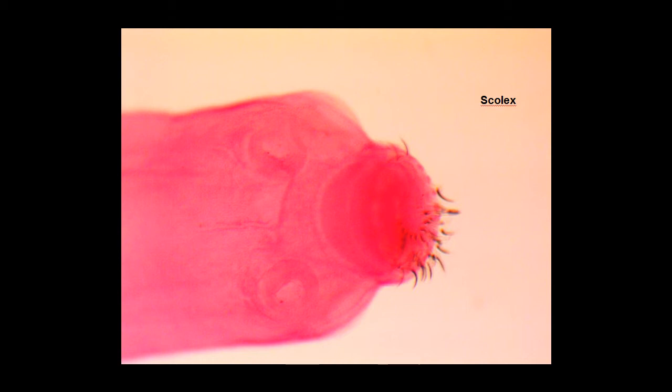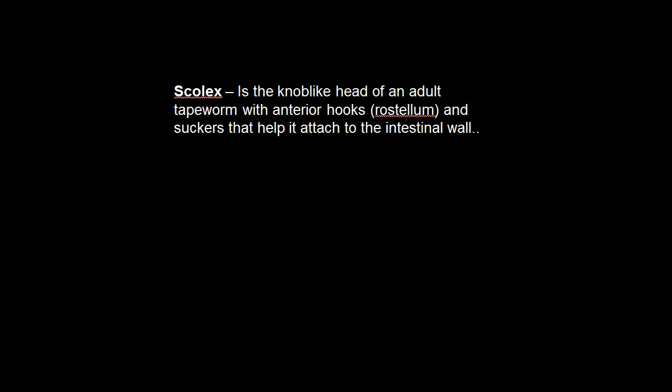Here is a picture of the scolex of the tapeworm. This is the part of the tapeworm that embeds itself into the intestine of the host animal. The scolex has structures that help it attach to the intestinal wall: the rostellum, which looks like hooks, and suckers.